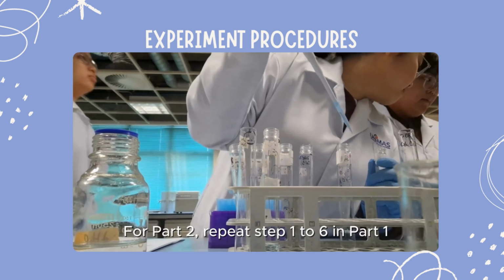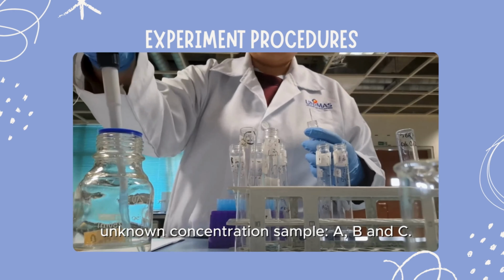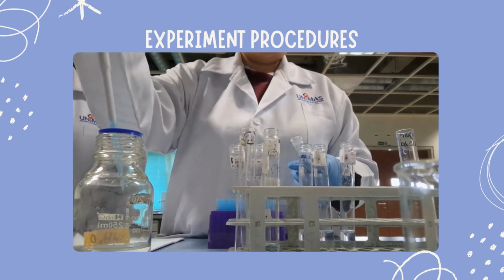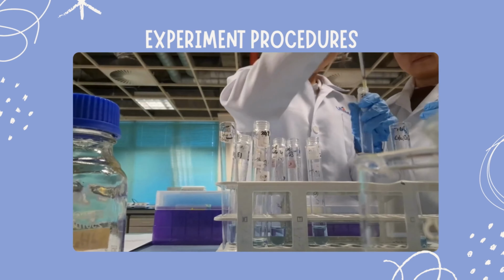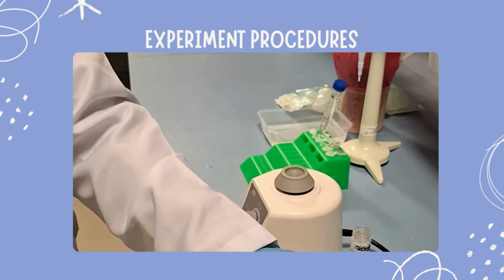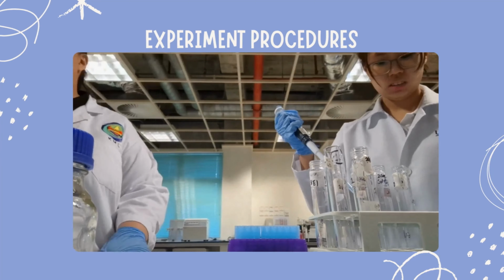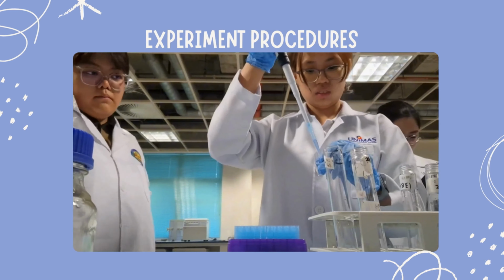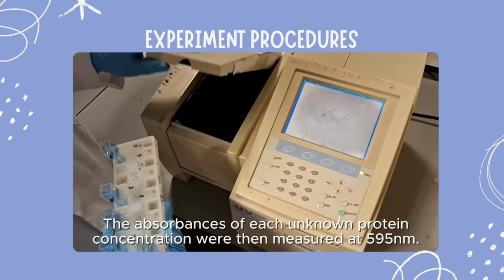For part 2, repeat steps 1 to 6 in part 1, but replacing the BSA protein standard with 3 unknown concentration samples A, B, and C. The absorbance of each unknown protein concentration was then measured at 595 nanometers.